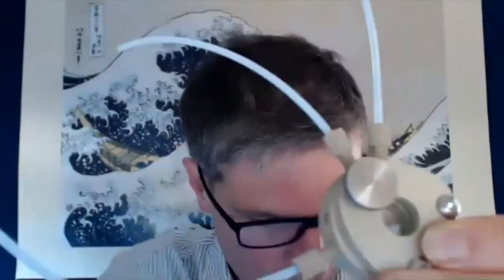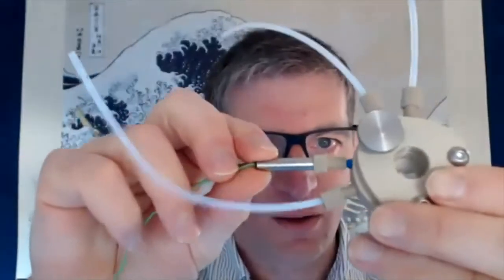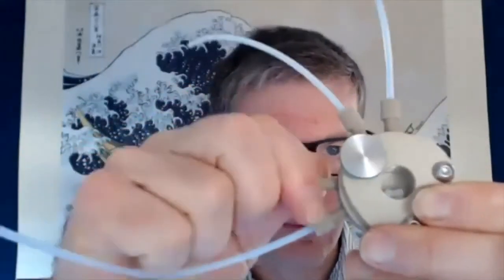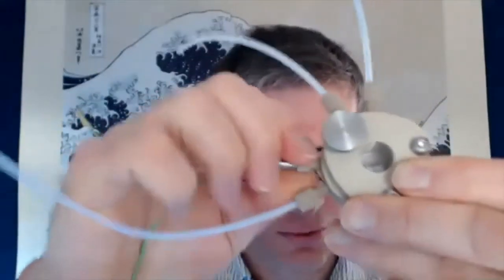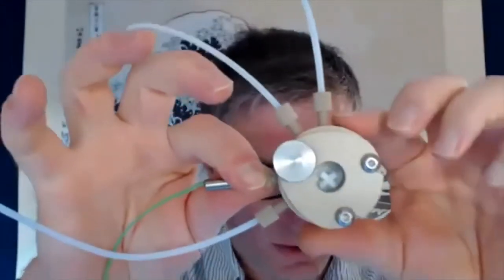And then you can put instrumentation in. If I take this port out, this is just a standard thermocouple going through a standard HPLC fitting, and that can screw in the side so you can measure temperature. So that's the single unit that we'll be talking about, and I'll show you how those fit together. I'll show you that now before I go into my PowerPoint, so let me just share my screen.